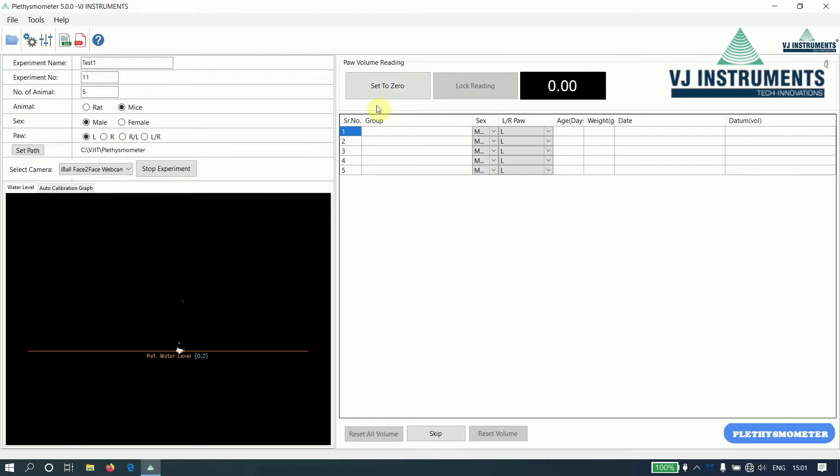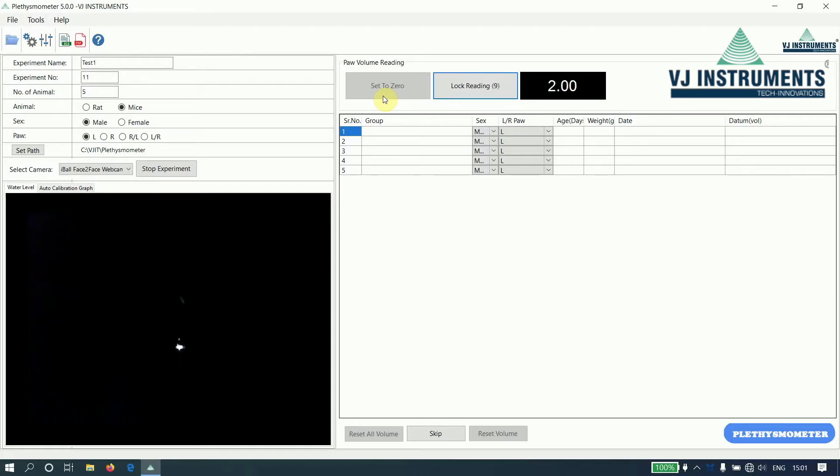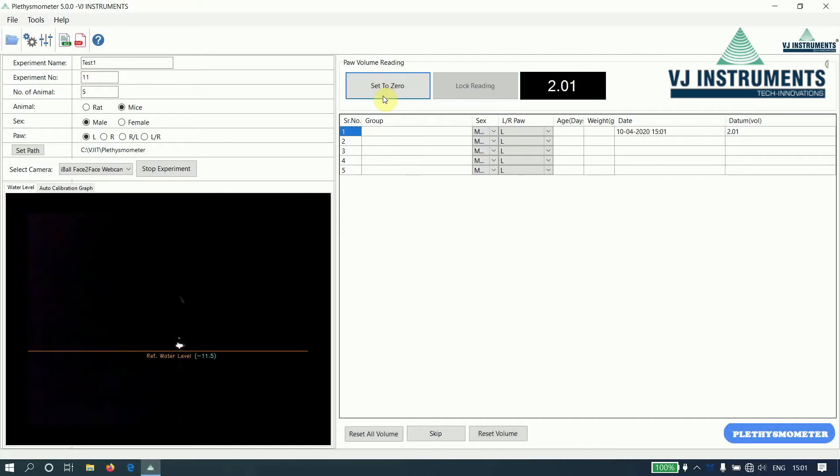So let us click on set to 0 and insert a 2CC cube to check whether the calibration we have done is proper. We have inserted the 2CC cube and we have got a reading almost equal to 2.01. So this conveys that our calibration setting is correct.